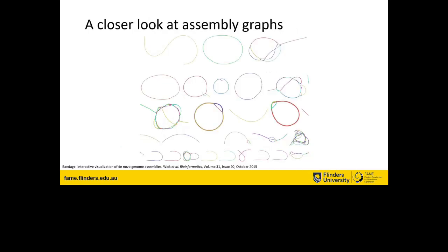So I wanted to see if I can get any additional information from the assembly graph we threw away at the beginning of the analysis to recover complete phage genomes from our data. So this is an example assembly graph. Each of these colored lines represent contigs. And you can see that there are some of these fragments, as well as these connected components that look like a few genomes are compressed or smushed together. So I wanted to identify such connected components that belong to phages and resolve genomes from them.